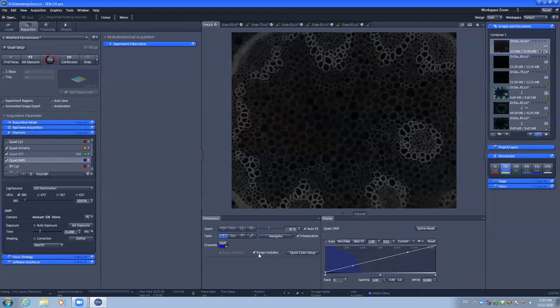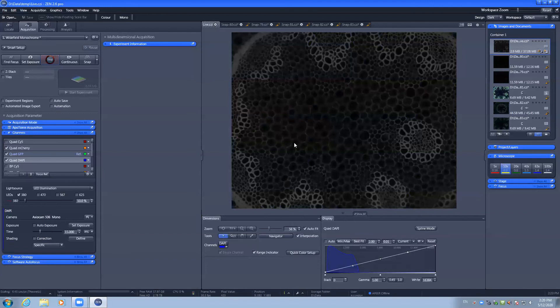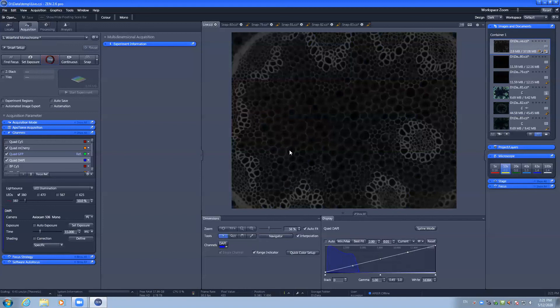When using the range indicator, pixels displayed as blue will have an intensity of zero and are below the detection range of the camera. You do not want underexposed pixels or saturated pixels. There should be no blue and no red visible.